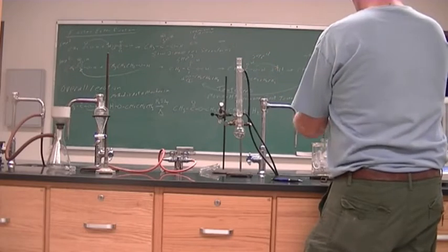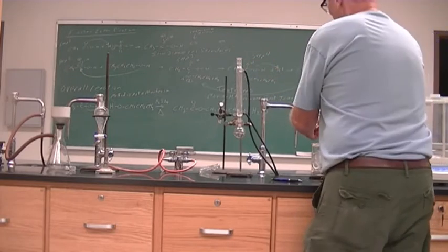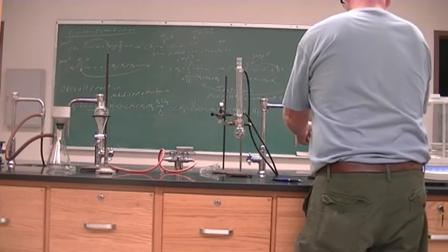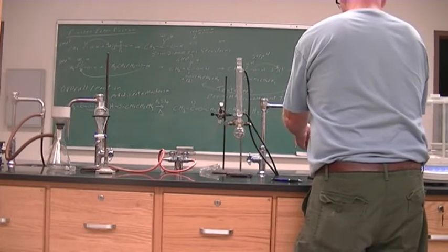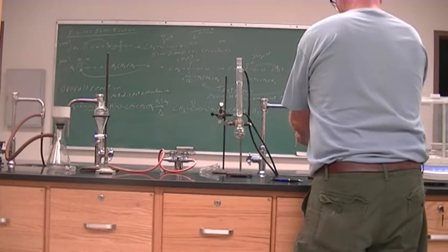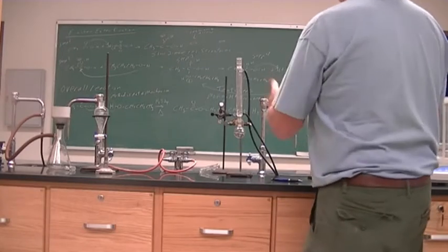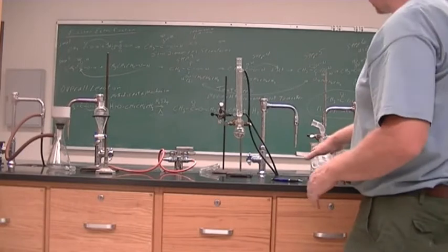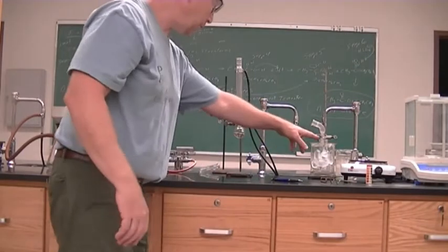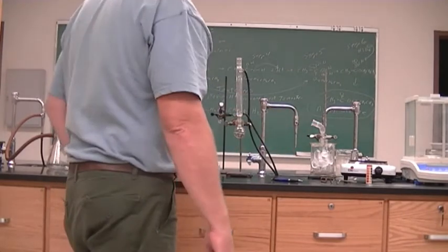This is just a simple distillation that we are going to collect in a 250 milliliter Erlenmeyer flask that is iced up, so that when we get our product over here, it does not evaporate. So we have it nice and cool, so it's going to stay in there. All right, so I usually start on the left side. I know what the level needs to be. It needs to be here to collect the liquid.